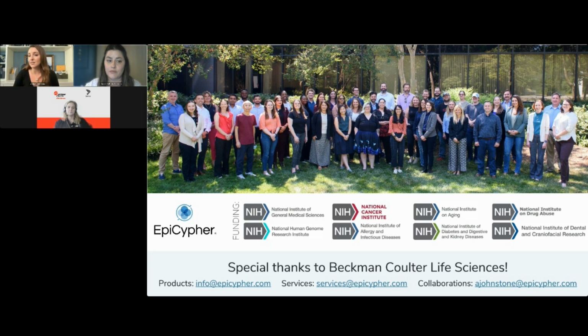in those cases, or if you're having just a hard time in general, we recommend two things. One is just screen for other antibodies. Maybe the antibody that you're using is not that great. So source 4 or 5 antibodies and test them. And then the second thing would be test native versus lightly fixed. And the key is lightly fixed. If you overfix, like in ChIP, you're going to completely destroy your chromatin and destroy your yields. So just a light fix, and we have protocols for doing that in our kit manuals.